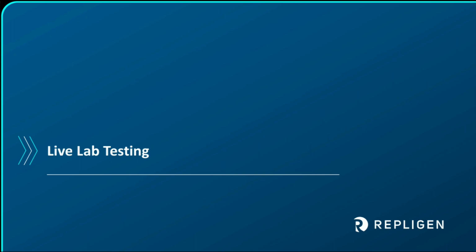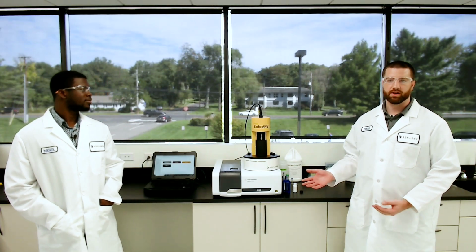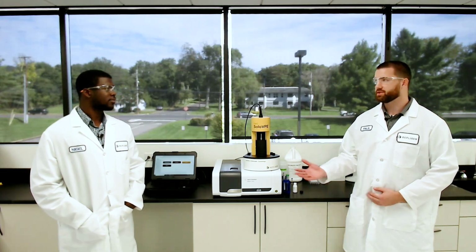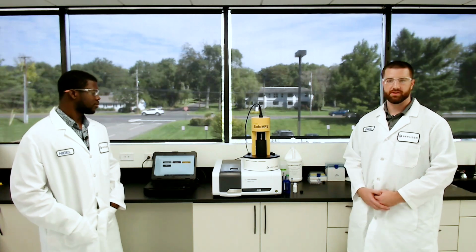Okay, so now that we're done with the presentation, we're going to go into live sample testing right here on our SoloVPE. We're going to measure a high concentrated plasmid and a low concentrated protein. So Nigel's going to talk a little bit about the system and go into the software.